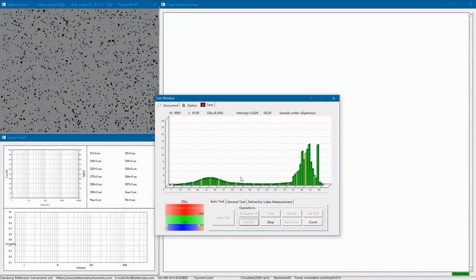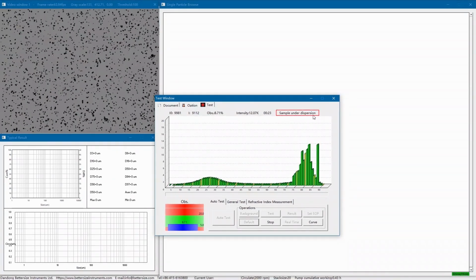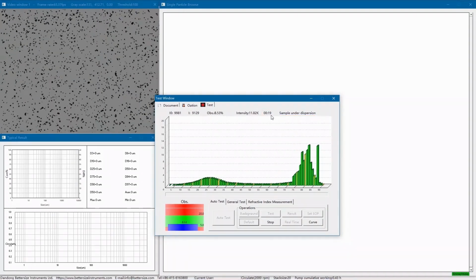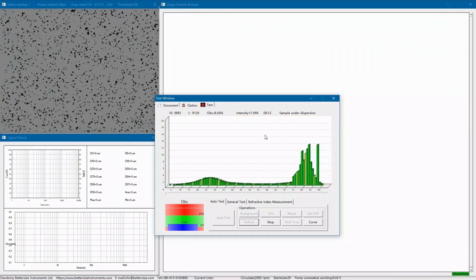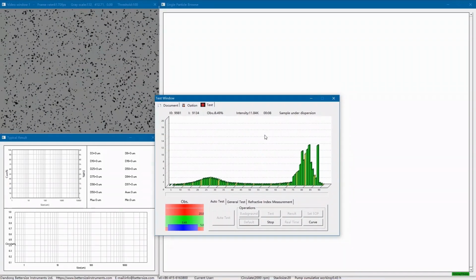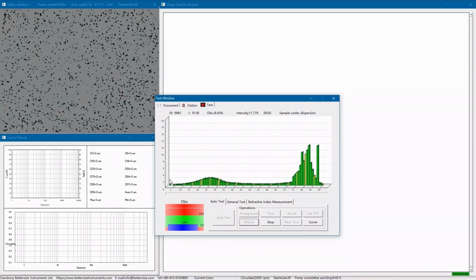After the sample is added and the required obscuration is reached, the instrument starts to disperse the sample. The previously set time is 30 seconds. After the dispersion is completed, the instrument will start the analysis automatically. Well, let me go over these windows in brief during the dispersion process. Firstly, the test window belongs to the laser diffraction system of the Bettersizer S3 Plus.